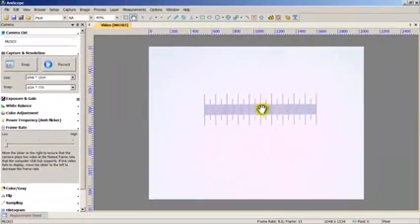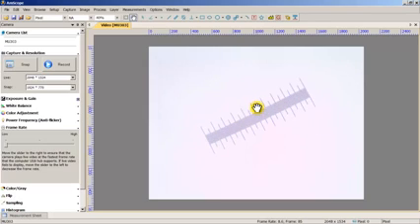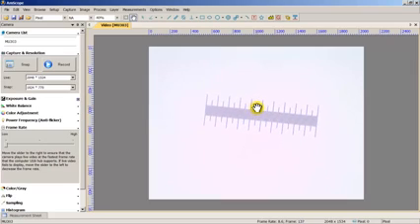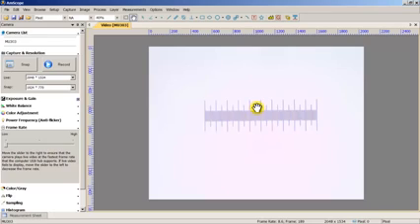And you see when I do that, the screen changes and it's a little bit more clear, the calibration slide on my screen. For some of you, when you put the camera in, it might be crooked like this, or maybe like this or something. Basically, just get your camera and straighten it out on the actual microscope itself and try to make it as straight as possible, okay? And I think that's pretty accurate, so I'm gonna leave it like that.